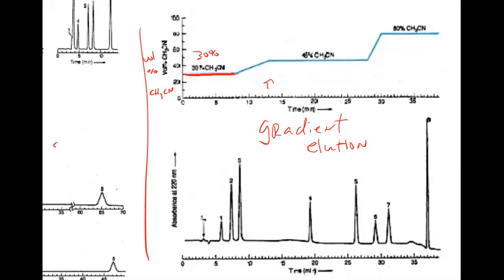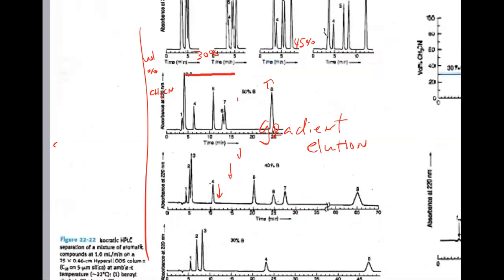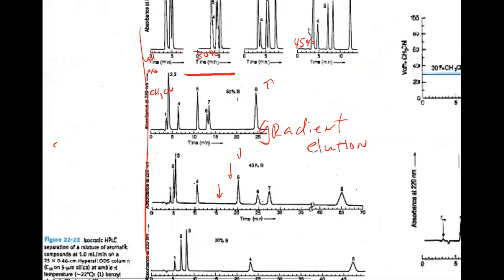All right, perfect. So we start off at 30% and we wait a few minutes, maybe like 8 minutes. That allows us to get peaks 1, 2, and 3 to the detector where they're separated. So far so good, but if we don't do anything, we're going to be here like 2 hours, right? So now, during the run, we're going to change the composition of our mobile phase. We're going to increase the amount of acetonitrile. I think if I'm reading correctly, this is 45% now. Again, remember what happens when we start running up to 40, 50%: things start speeding up, right?